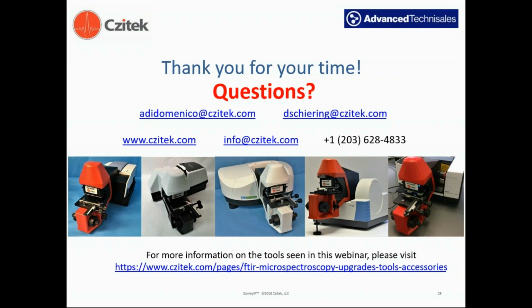I think the main differences are that it is customer installed and removed, so you can use it when you need it. It's not permanently mounted. It can be permanently mounted; you just leave it in there. So that's one aspect of it. I think that it's relatively simple to use in comparison. It's much like a microscope you'd use in a high school or freshman biology class in terms of the microscope controls.